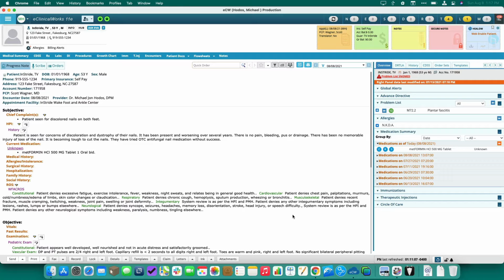This workflow also minimizes printing and scanning, and nearly all the documents should be created in ECW, and only a minimum amount of paper is used to send with the specimen, and there are no documents to scan and file if you use the iPad for signing your form. And finally, the orders, the patient authorization, insurance information, and the test data are all electronic and available to everyone in the chain, reducing delays and eliminating phone calls.